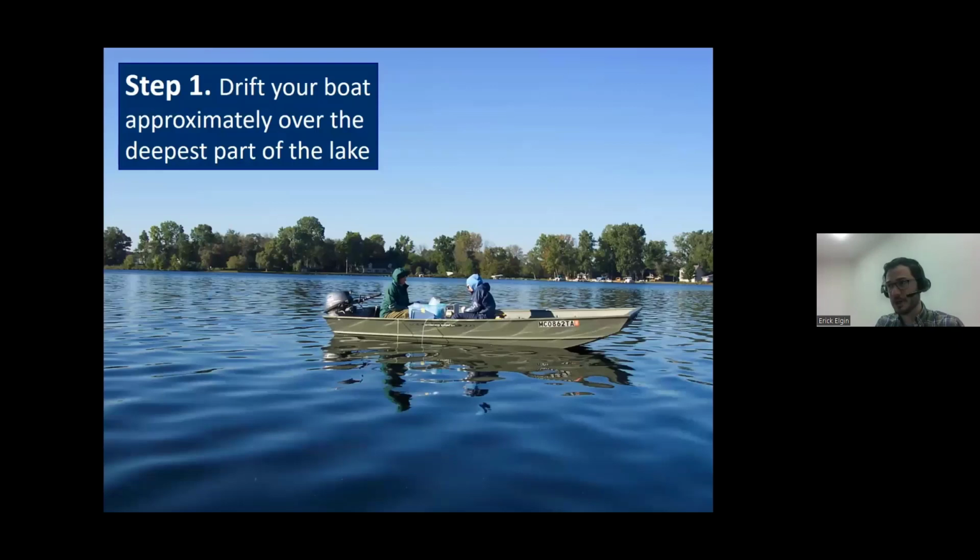So here's our protocol. Step 1 is that you drift your boat approximately over the deepest part of the lake. We don't need you under exactly the deepest location, but near the deepest location. And we have you drift your boat over that location and not anchor if you can, because if your anchor hits the bottom, it will resuspend sediments.